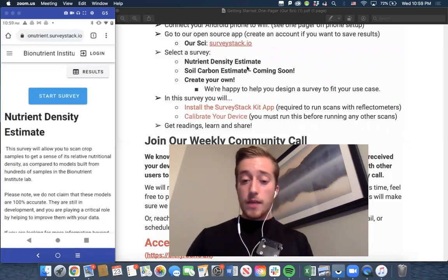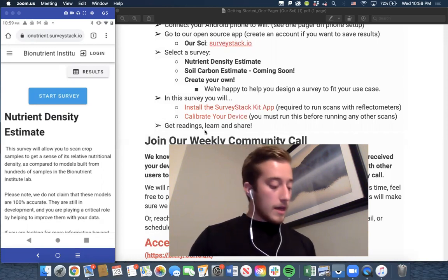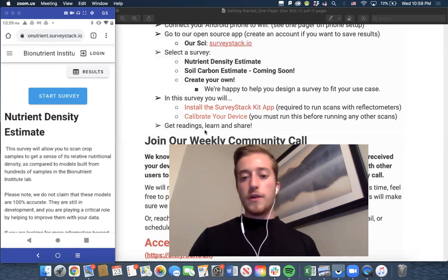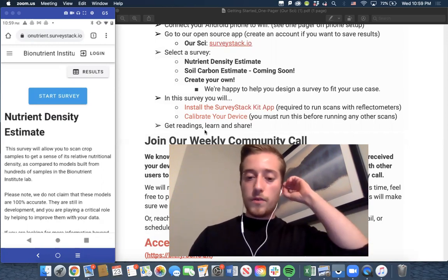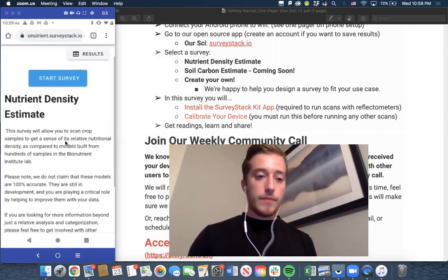And now that I've just calibrated my device, I'm ready to actually run my reflectometer and get a nutrient density estimate. So this is the final step in our getting started. And of course, if you're running a different survey, it just means you're ready to start running that survey, right? Like you've completed calibrating your device and you can run some accurate measurements.